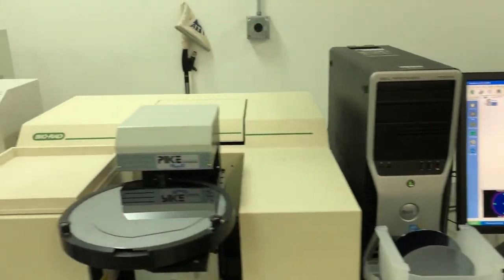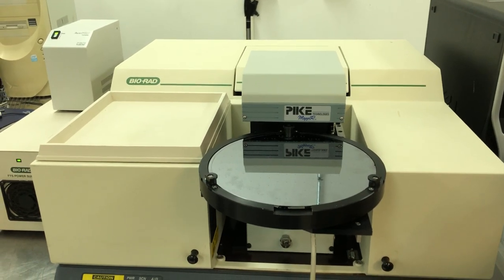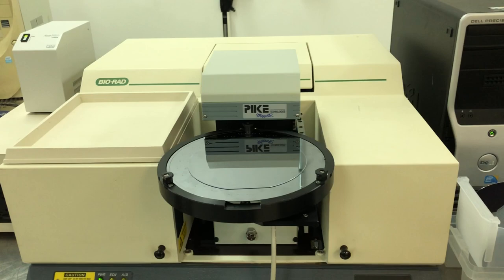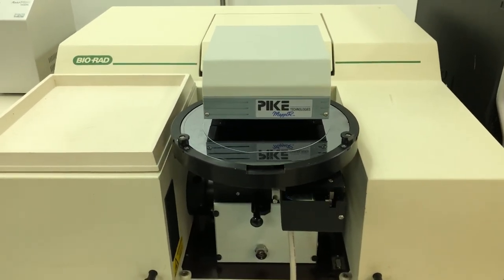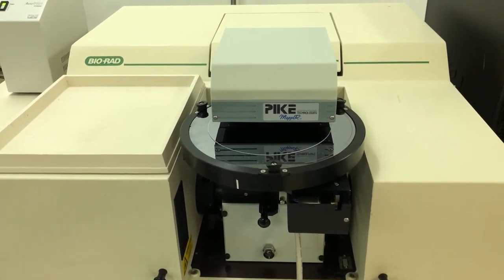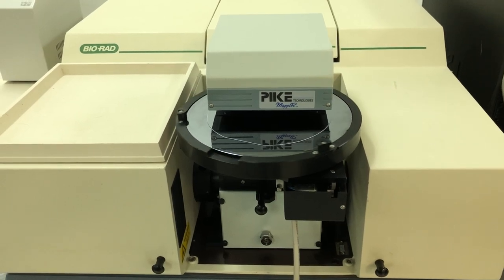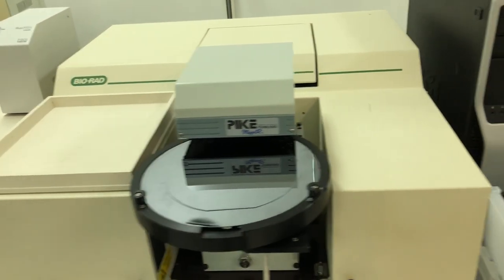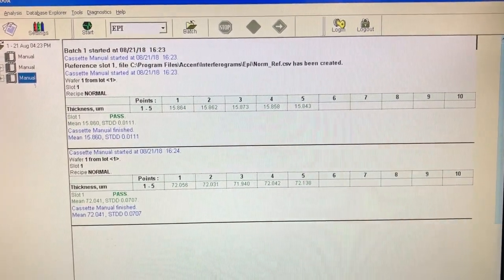Let's run the 70 micron. Testing the center, 180 degrees out, 270 degrees out, and 90 degrees. Here's the data for the 72 inch — actually it was 72 microns.